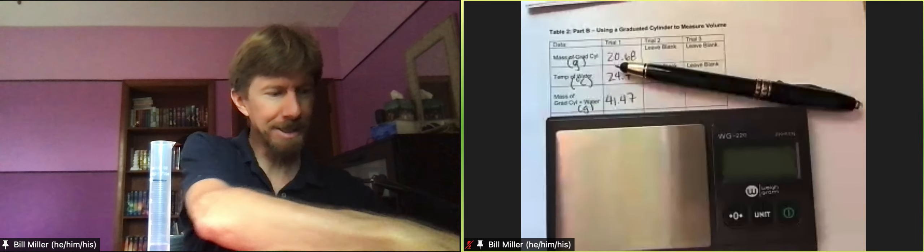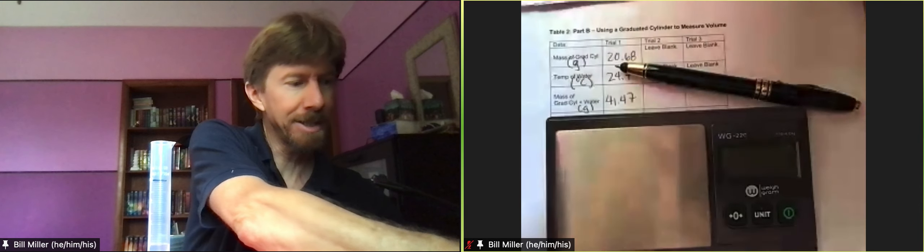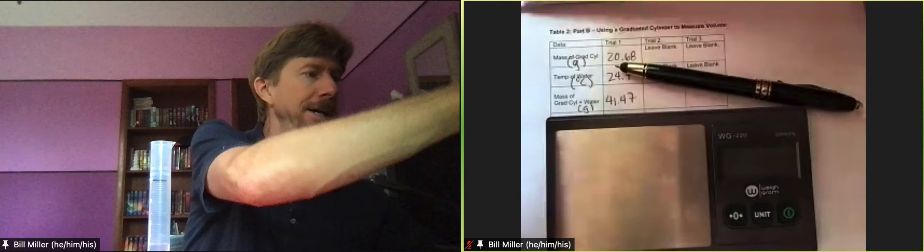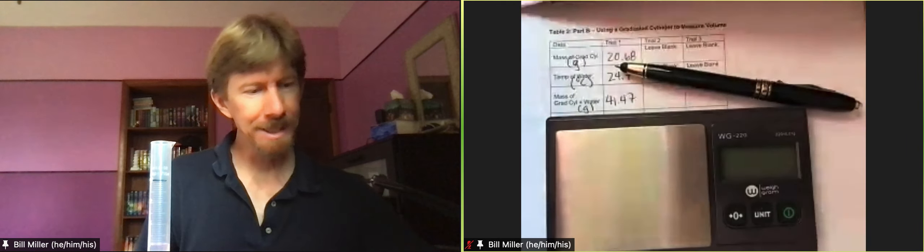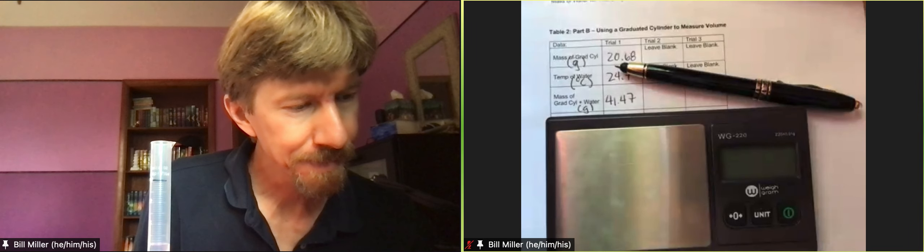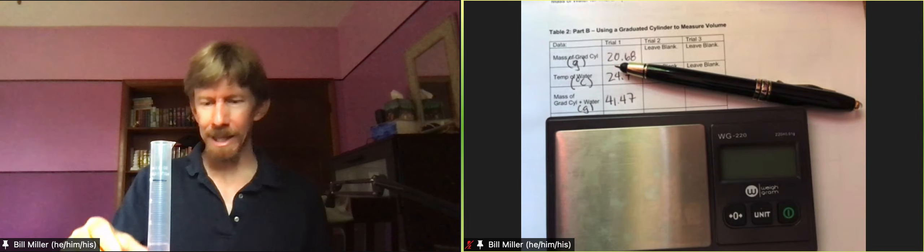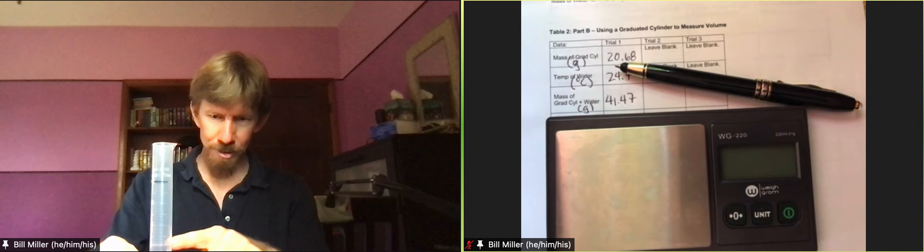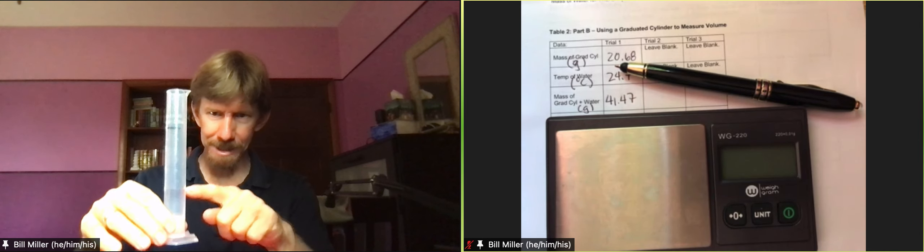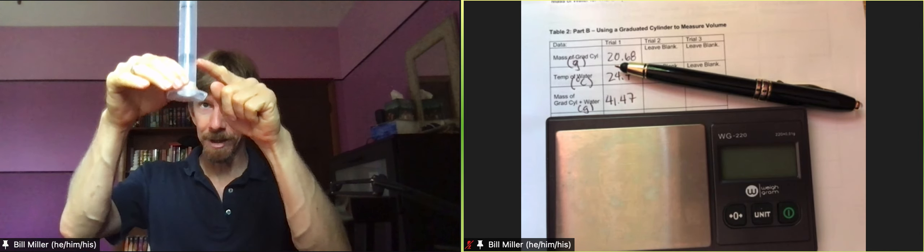It talks about the meniscus too, so please read over these as you go through the lab. It talks about the meniscus. Take a picture of the meniscus in the graduated cylinder. That means you're going to want a picture looking straight across at the meniscus, which is this interface.